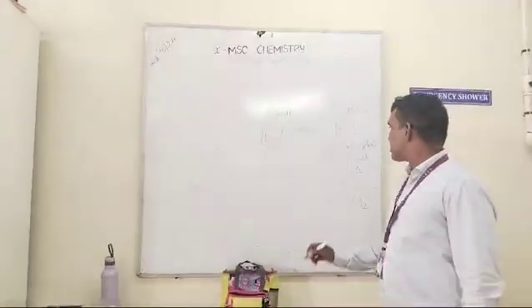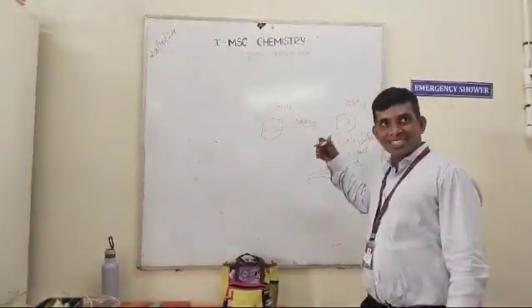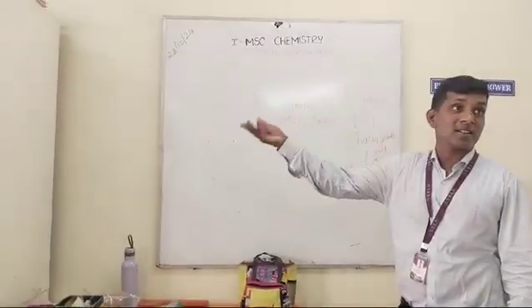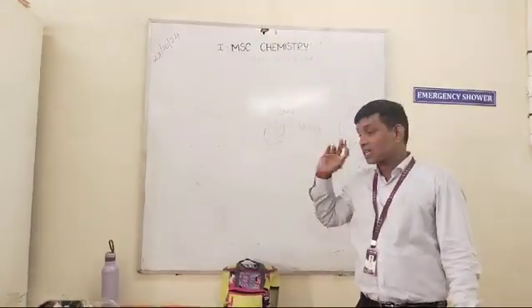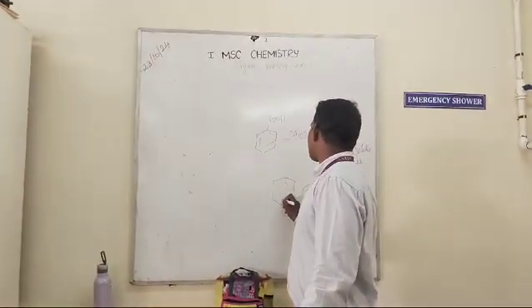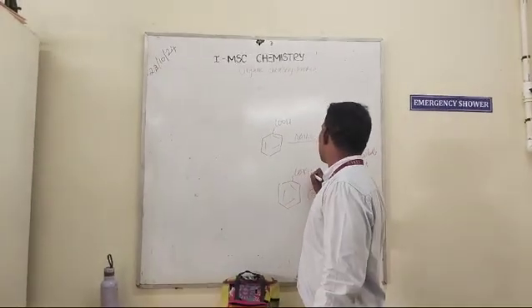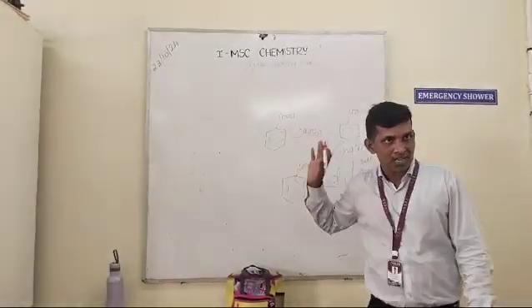Okay. After that, if you add hydrochloric acid, once again the benzoic acid will precipitate, because it is a simple neutralization reaction. With the simple neutralization reaction, I am able to get the benzoic acid back. Right? So this is the first point everyone should understand.